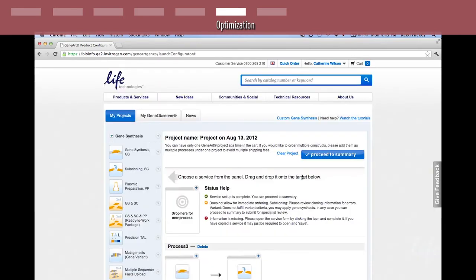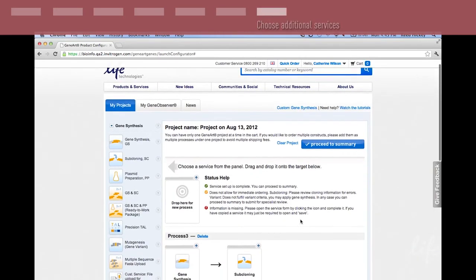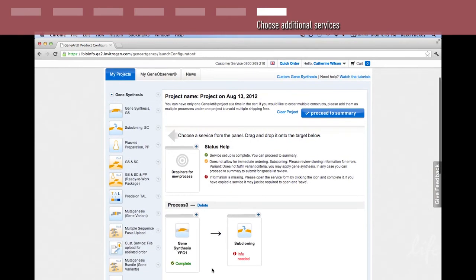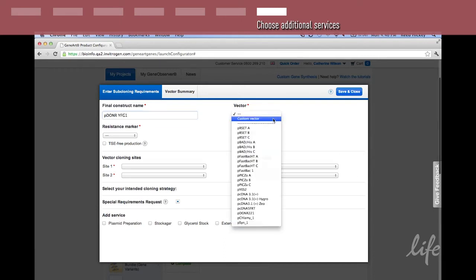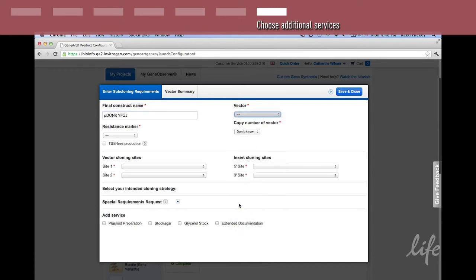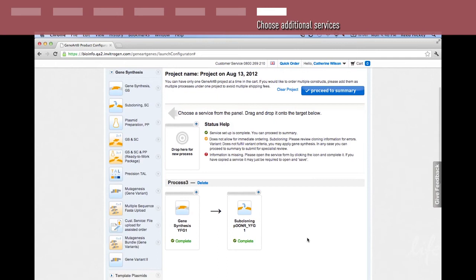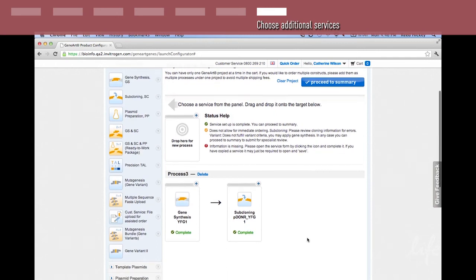For cloning into a Gateway entry clone, select the subcloning tab. Enter the name for your construct. Select pDONR221. Click save. The project is now complete and you can proceed to a summary.